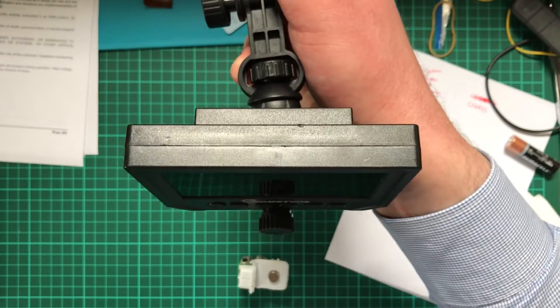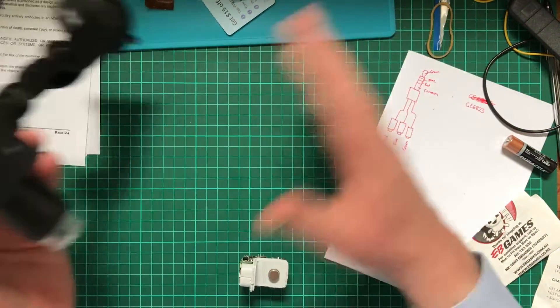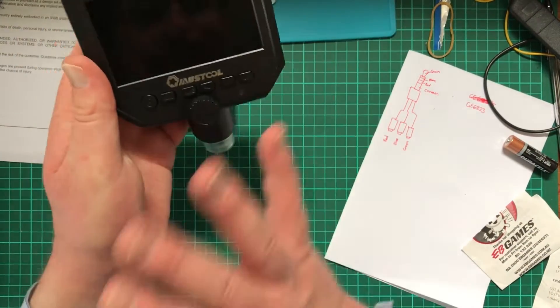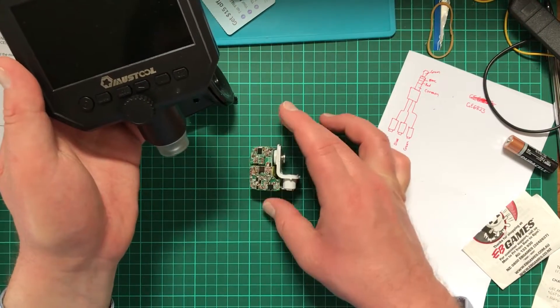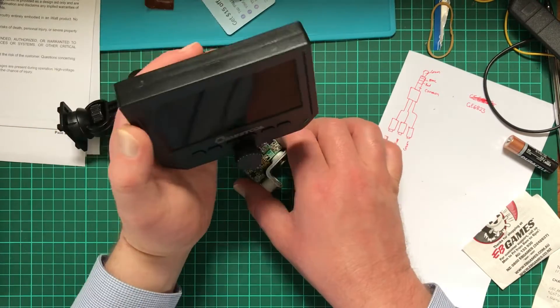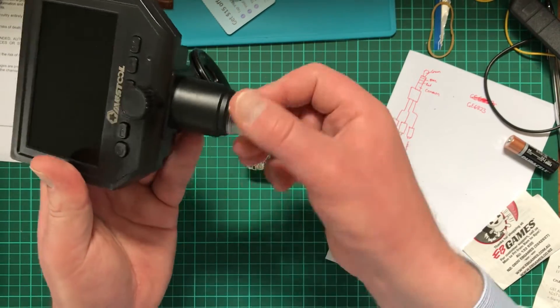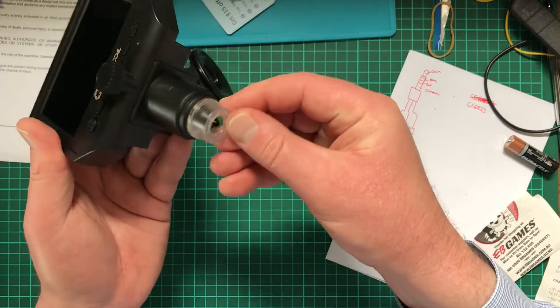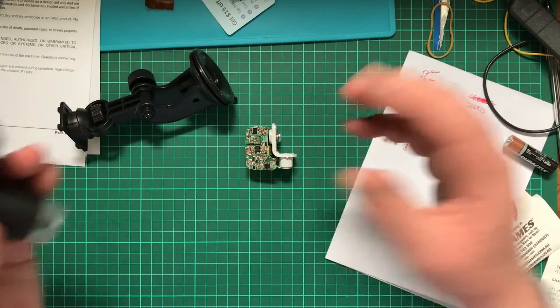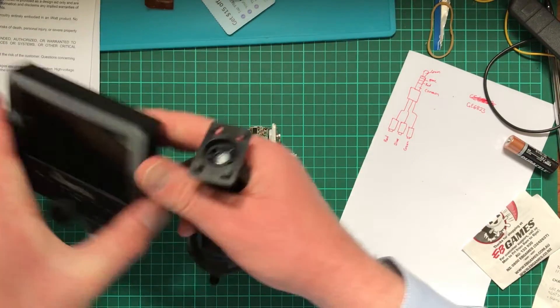You probably want to have it up a little bit high, and I noticed that even having it high up off the bench, as long as you focus it in, you'll generally get a good view. But if you really want to get close to something — like looking at a single tiny surface-mount resistor — the best idea is to have it relatively close. The LEDs do actually help. I found this diffuser, even though it's pretty poor, does an okay-ish job, but it's still not fully reliable. You'd want to be in a well-lit area and not rely on the LEDs — otherwise it's terrible.